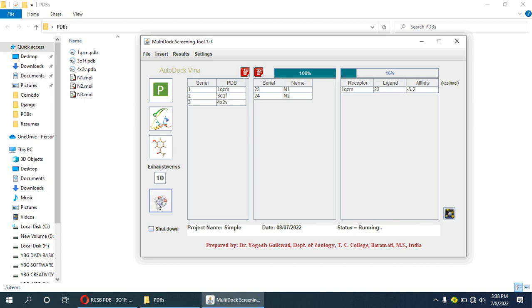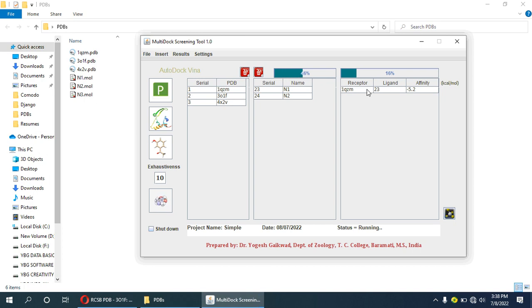The docking process has started. Now this is the result for the first protein, 1QZM, and ligand number 23. This is the least energy pose — pose one energy.